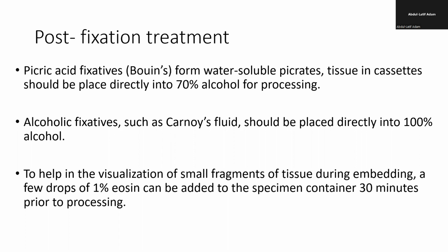And these form what we call water-soluble picrates. And so after fixation, you need to remove this precipitate of picric acid fluid. Okay, so you need to remove them so that it will not cause false results. Because if you find this picric in it, it will form artifacts, and it can block the microscopic evaluation of the section. So you remove them by dipping them in 70% alcohol.